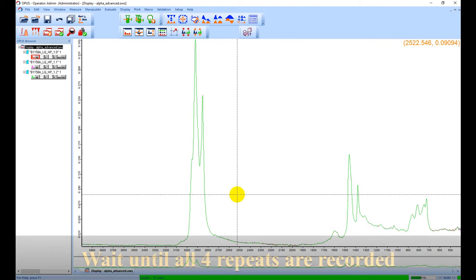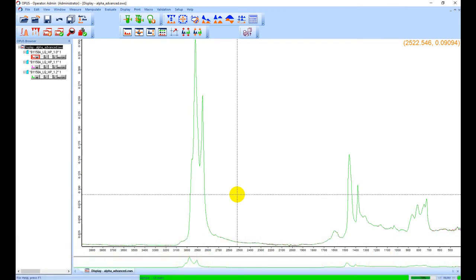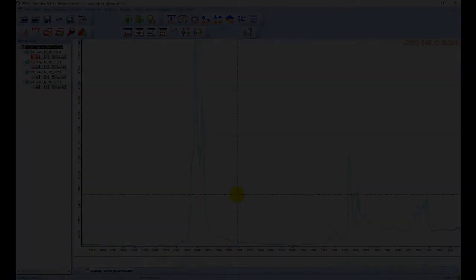Once all 4 spectra have been recorded, you can repeat this process 3 more times to measure all the remaining 3 samples and record the in total 16 spectra per binder or aging state. The recorded spectra are usually saved immediately after measurement and can then be used for any post-process data analysis.